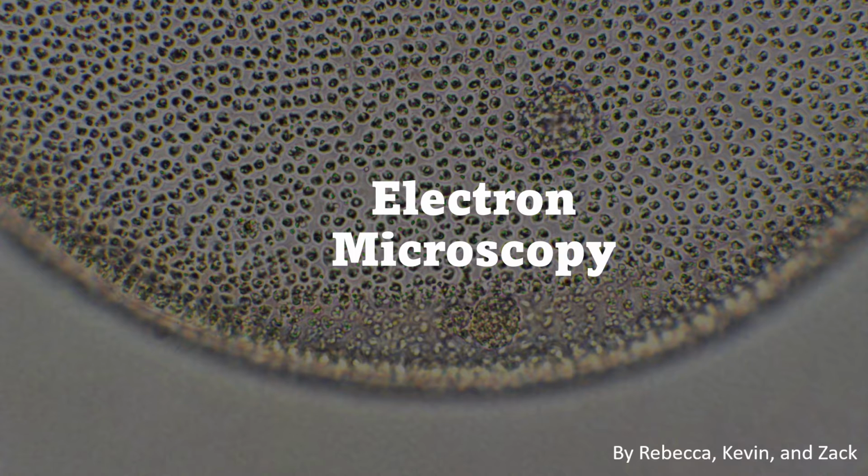During this presentation we'll talk to you a bit about an overview of what electron microscopy is, etc. Then we'll go more in depth into the two different types of electron microscopy, showing their advantages and disadvantages, and then right at the end we'll be talking to you about data analysis, how to deduce the data that we have collected from these methods.